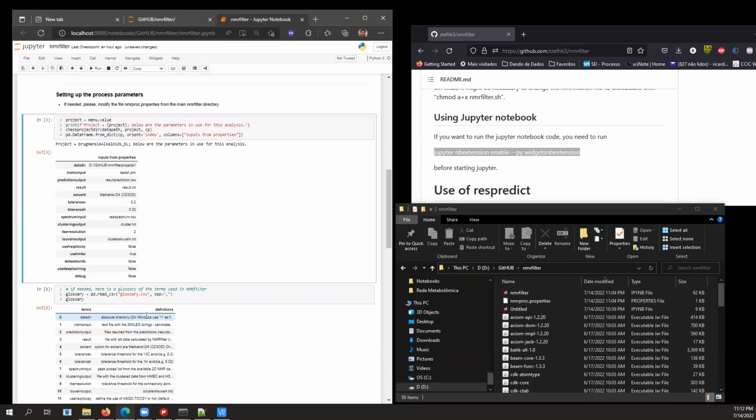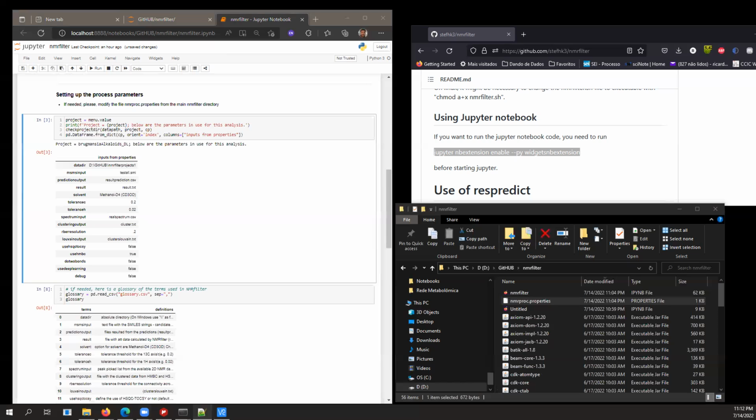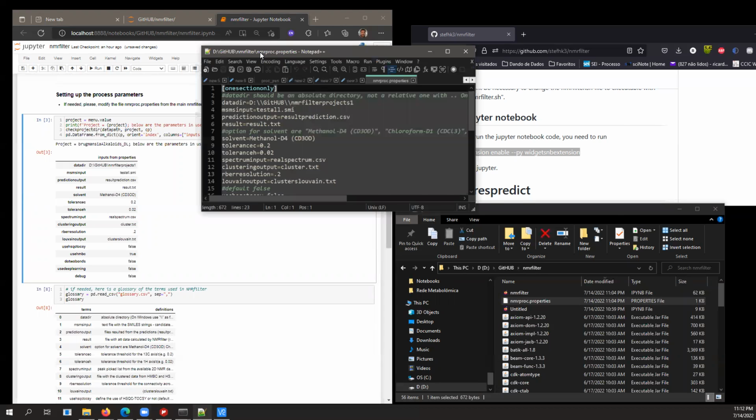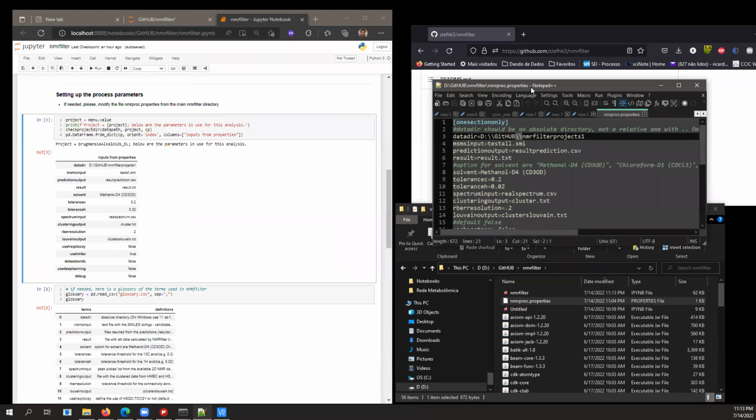The cell is showing the properties that we choose to apply the methods. This folder is in here. We can open that just to see. Let's go for Notepad++. And since I'm on Windows, this is the important thing I have to do. I have to set the path for the projects. Okay, and since I'm working on Windows, I have to use this format here. Otherwise, it has some issues with Python, right?